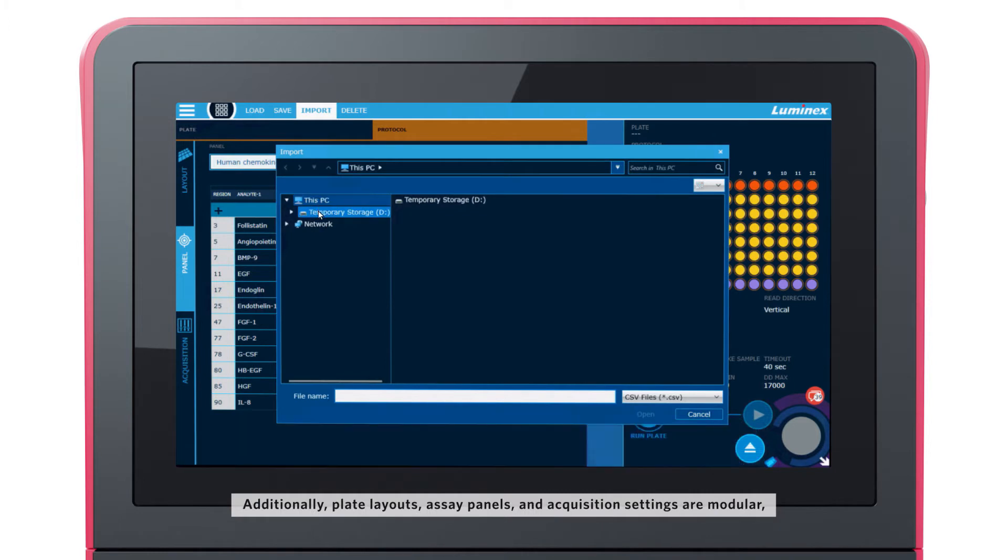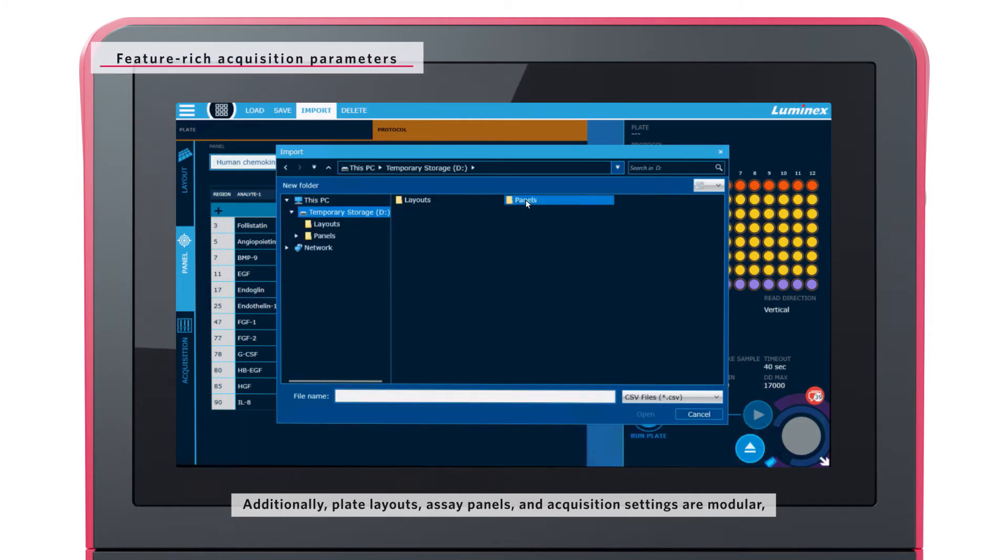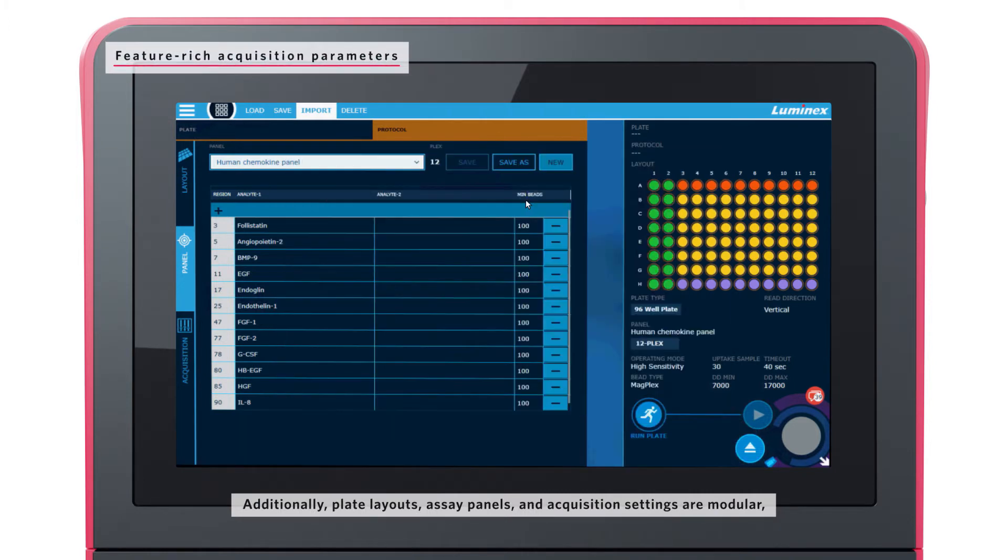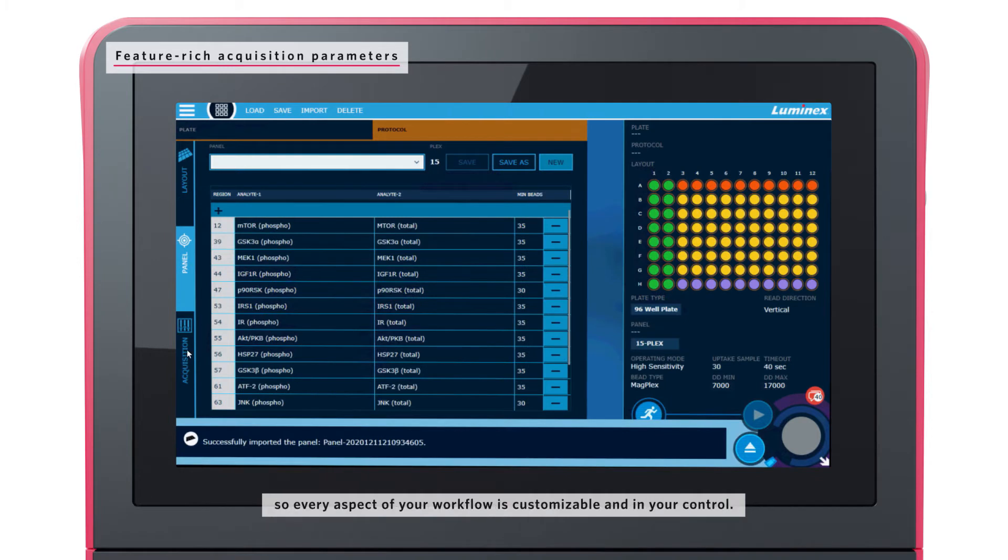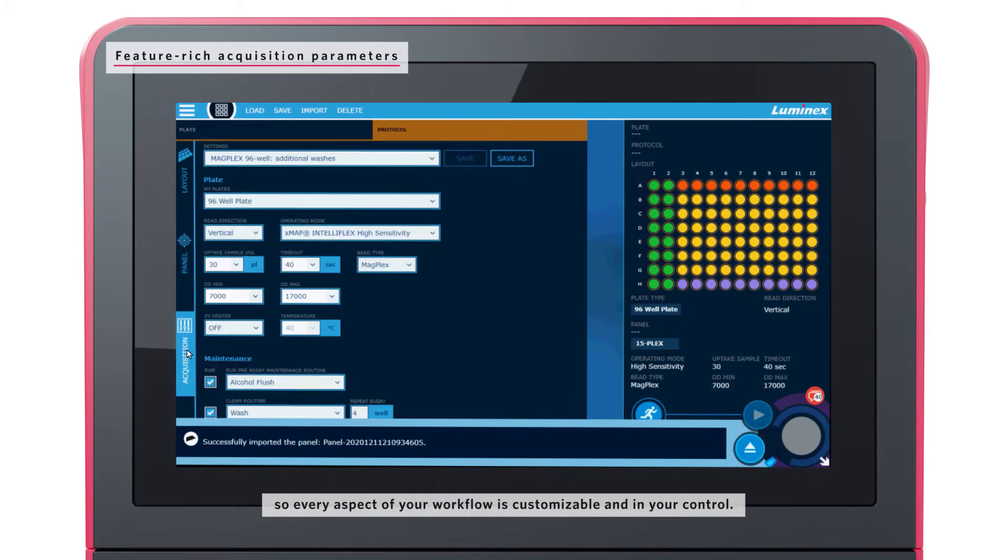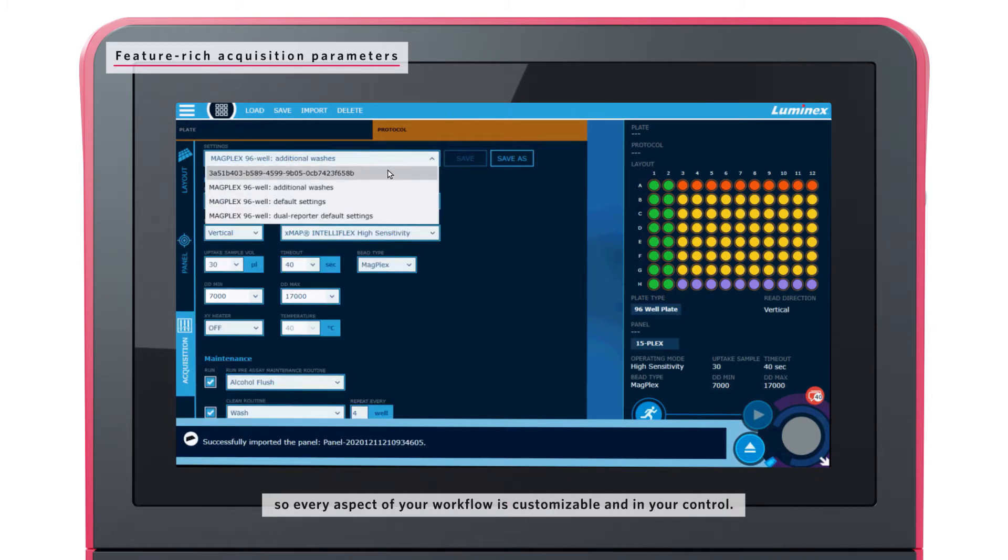Additionally, plate layouts, assay panels, and acquisition settings are modular, so every aspect of your workflow is customizable and in your control.